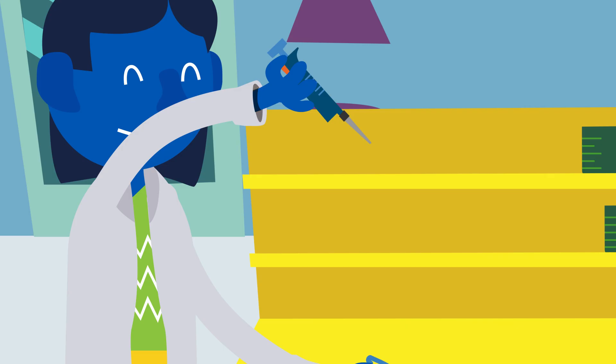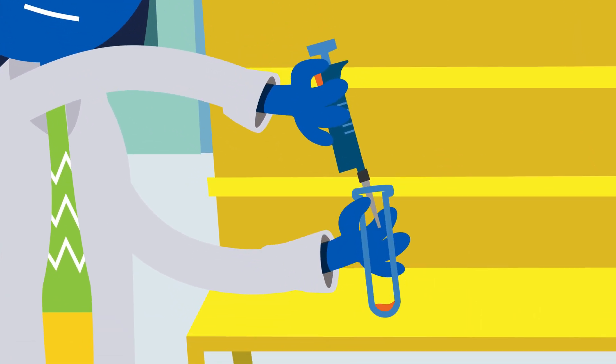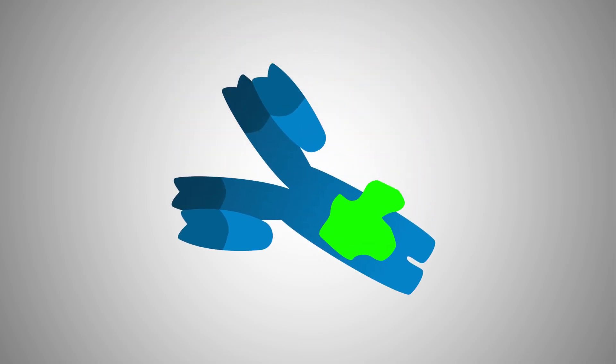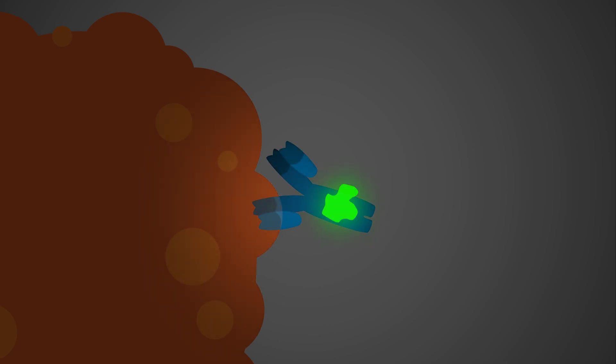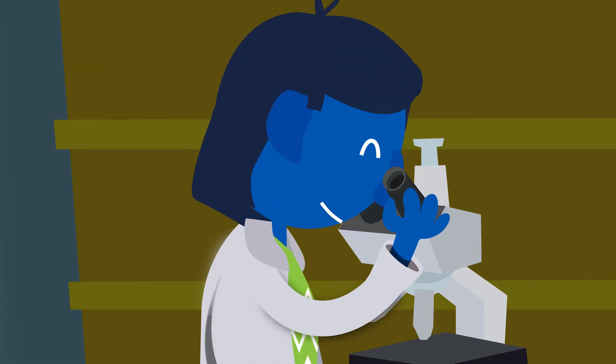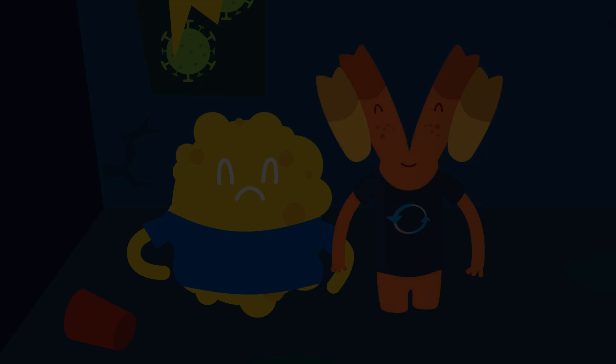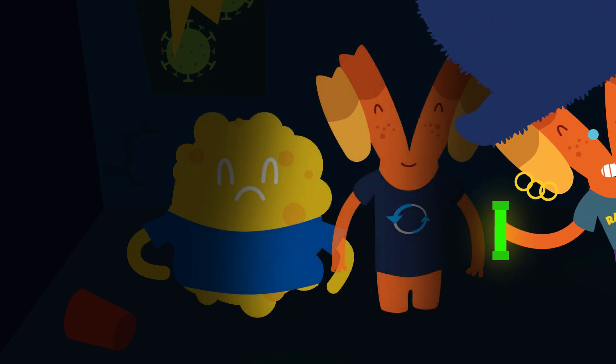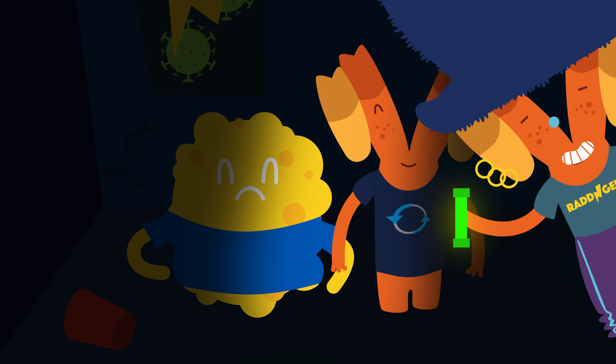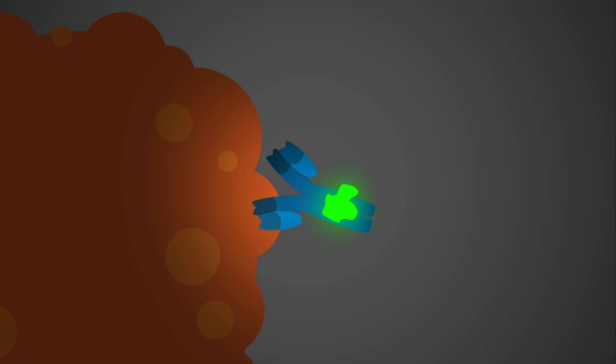Whatever type of antibody you use, you'll need a way to see it in your experiment. Scientists conjugate their antibody with a reporter molecule, like a fluorescent protein or an enzyme that makes a particular substrate emit light when they're exposed to each other. This allows the researcher to see the antibody upon reporter activation. Think of these like glow sticks, which can help you see specific areas when you're in the dark. This reporter is often referred to as the antibody conjugate.